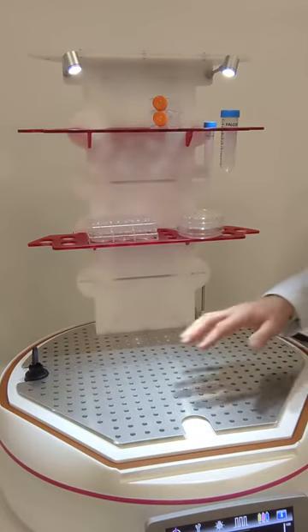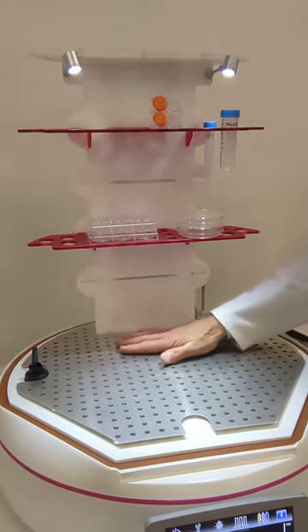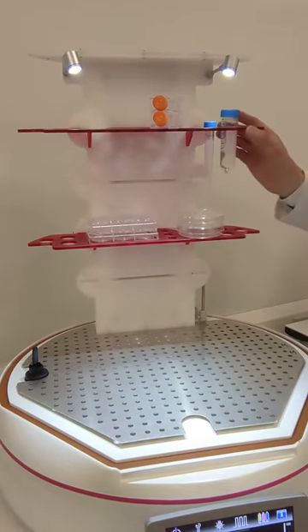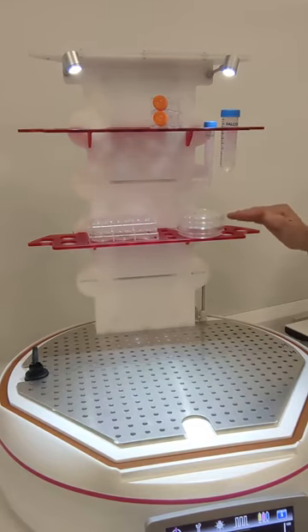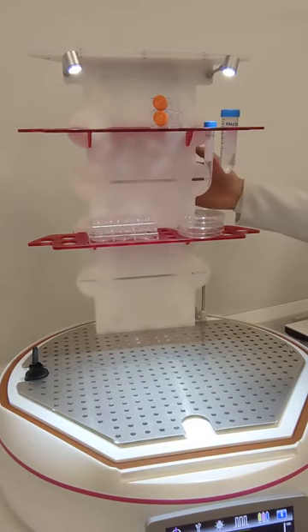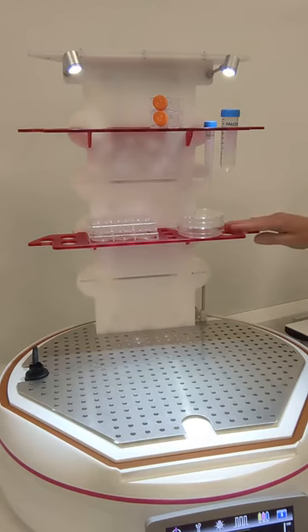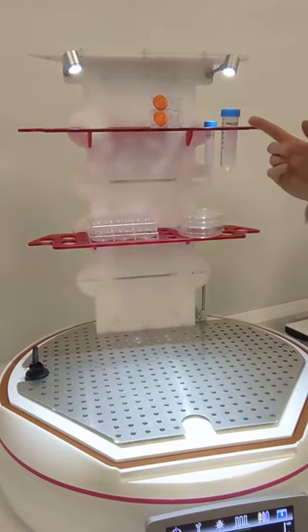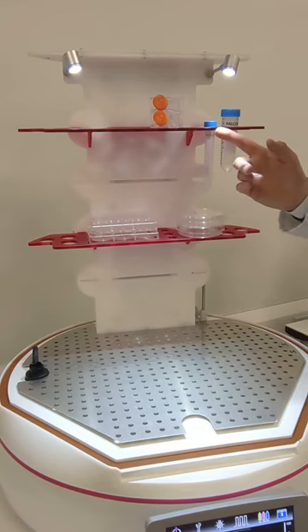Inside the HypoxyLab, we find a removable stainless steel false floor, 2 shelf units for which there are 4 positions within this turret, shelf units that are sized to take large or small petri dishes, multi-well plates, flasks, and also accommodate large and small Falcon tubes.